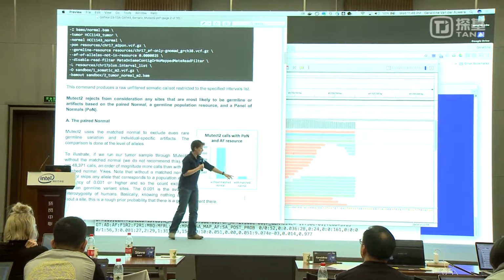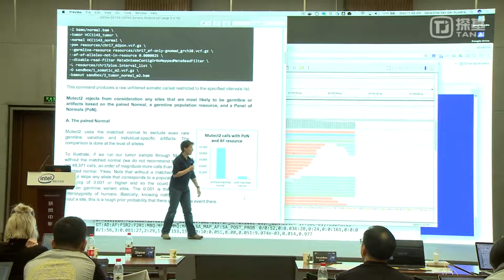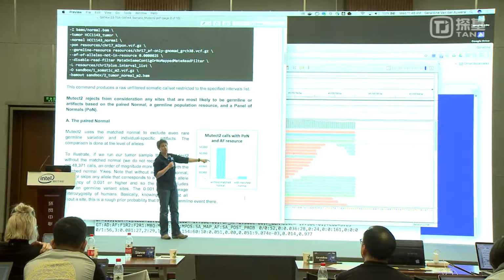Okay? This is what you get with your matched normal. This is what you get if you don't have it. Right? It's a huge difference.